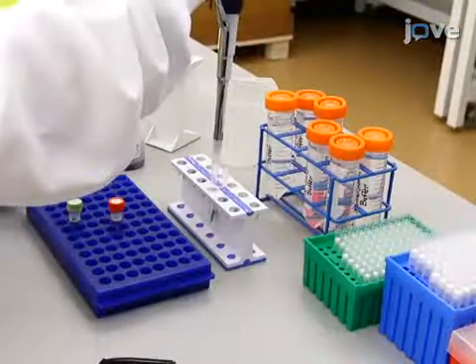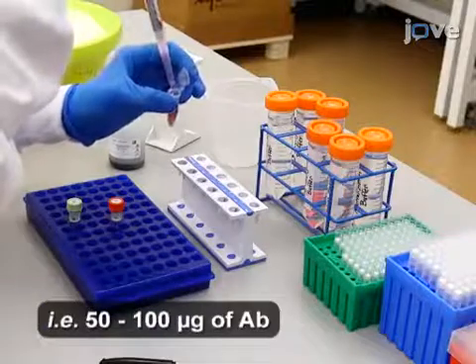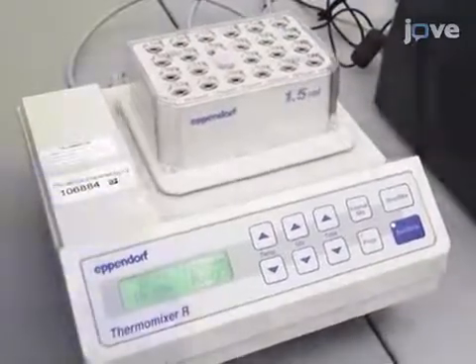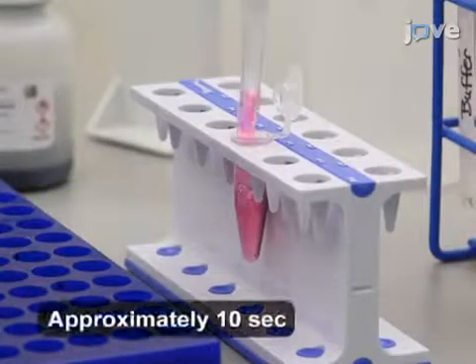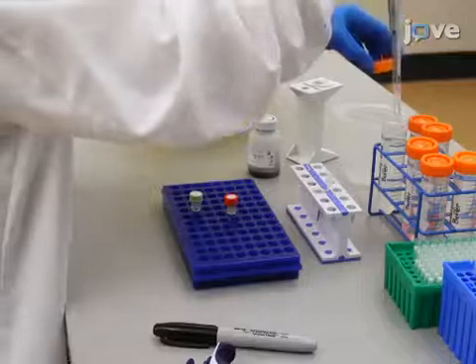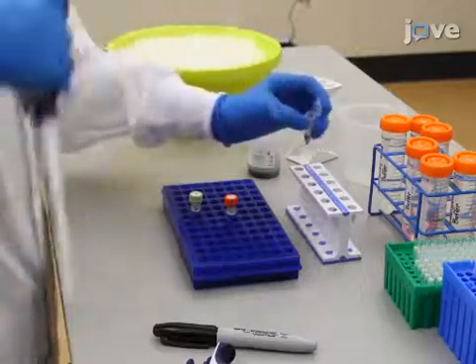After another 10 seconds, carefully replace the binding buffer with 1 milliliter of the antibody of interest and mix the sample for 60 minutes at room temperature. At the end of the incubation, return the tubes to the magnet and remove the supernatant when the beads have moved to the side of the tube. Then rinse the beads and antibody mixture by two 10-second washes with 250 microliters of antibody-binding wash buffer per wash.